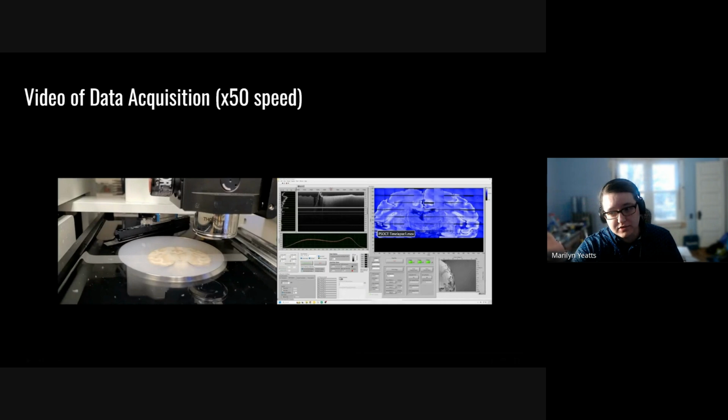The other thing that you don't see as an artifact in this particular slice, because it didn't happen in this slice, is if the table gets bumped while I'm imaging, there can be ripples in the water in the PBS solution, and I will see those ripples in my images and they will mess them up. That could happen for a single tile but not show up on any other tile. And if we can catch it in this phase, then we can just re-image the slice before we cut it. Once we've cut the slice, it's done, and re-imaging a slice is very, very difficult.